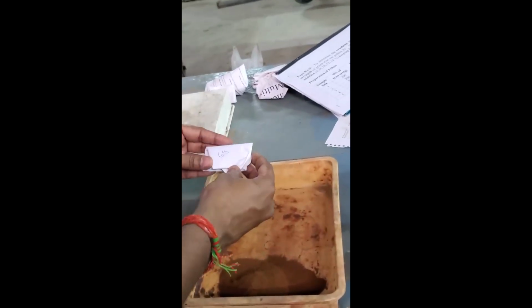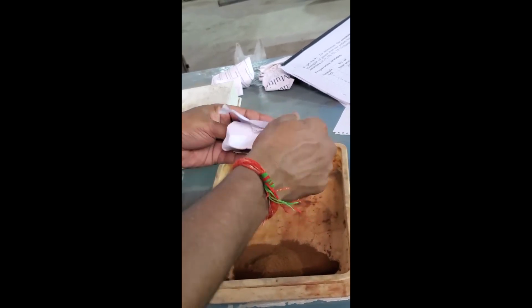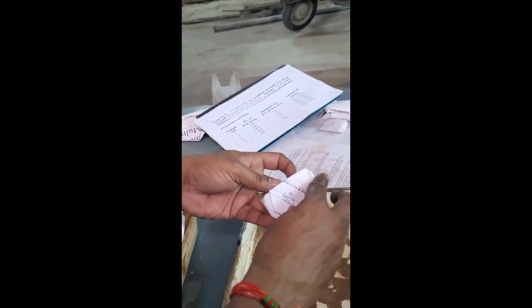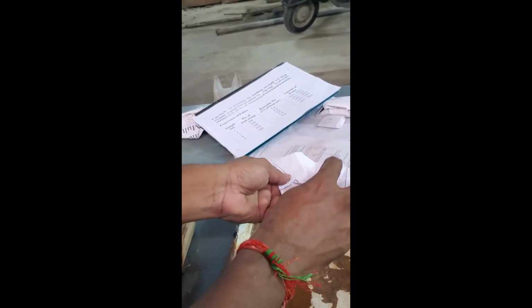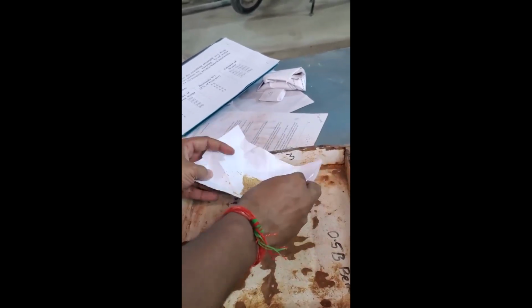Fourth one, 3% of bentonite means 6 grams for the iron ore. So, 6 grams. Here in the fifth tray, we are adding 4% bentonite. This is 200 grams, 4% means 8 grams. So, 4% bentonite is 8 grams, and the bentonite is ready to add.